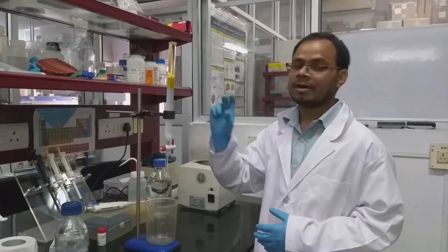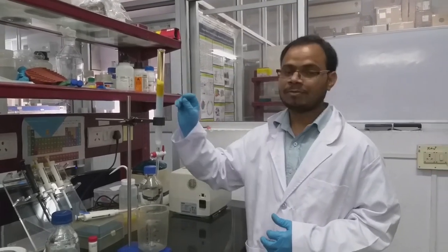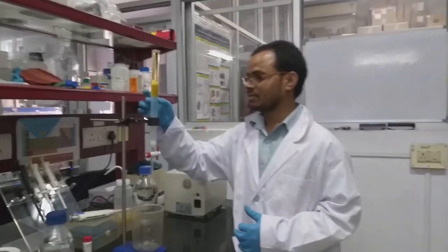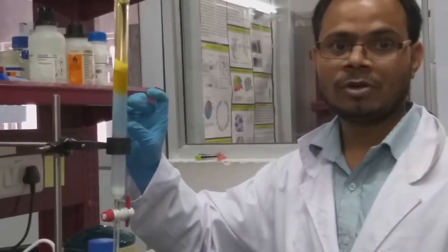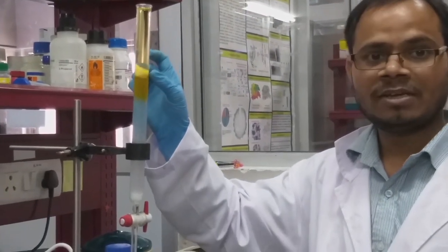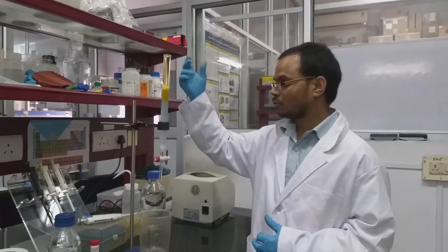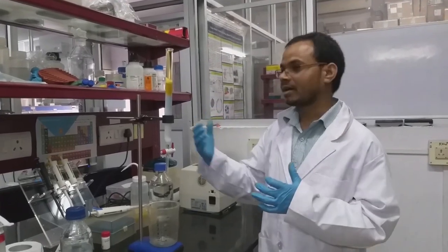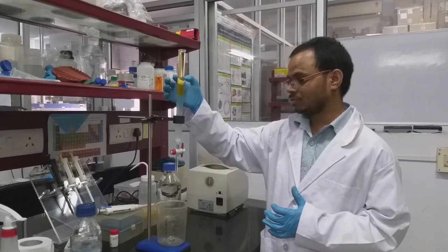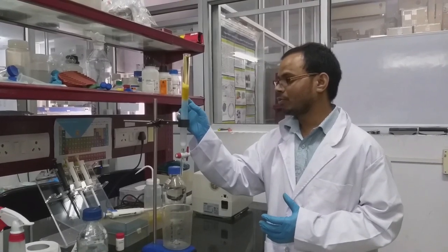As we can see, we have loaded two components. One is the high molecular weight blue dextran, another one is fluorescein, which is low molecular weight. So as we can see, blue dextran is eluting fast compared to the fluorescein, which is yellow, orange in color. So you have to elute it completely using the buffer. When the buffer comes to an end, you have to replenish with the buffer, and you have to collect the fractions.